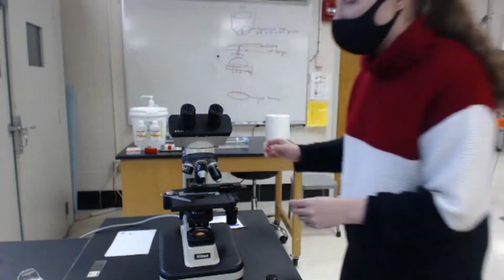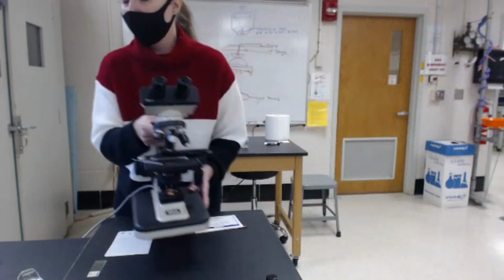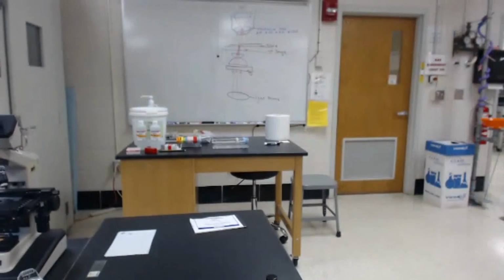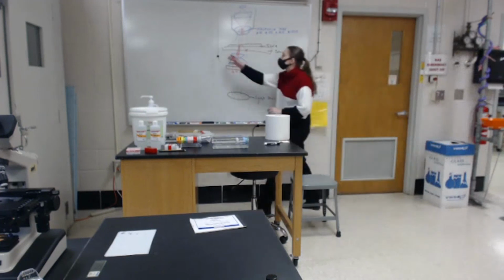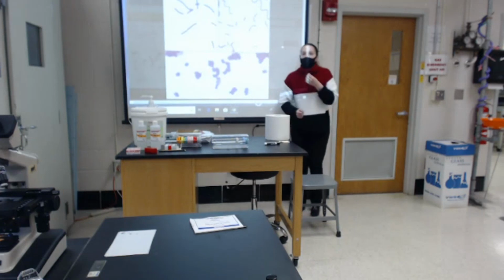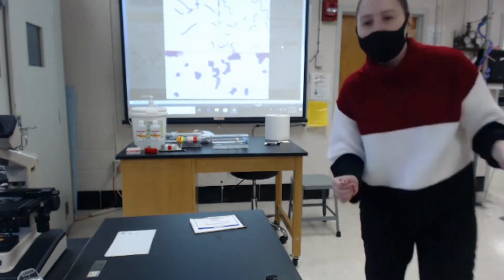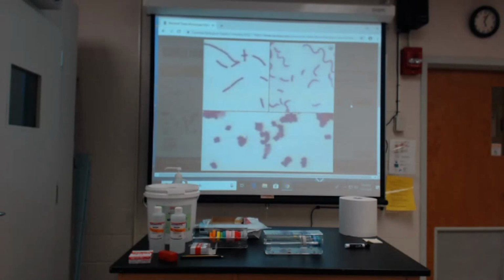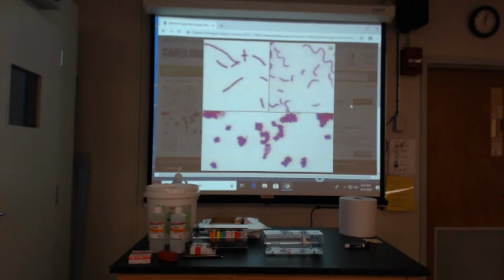The last thing I'd like to do is show you what you should have been able to see under the microscope. So let me open this up. Try to move it a bit closer. I'm not sure if the lighting will work. There we go. Yep, that's a bit better.